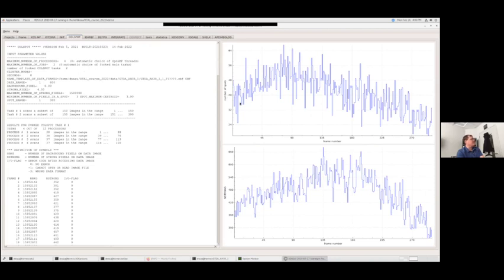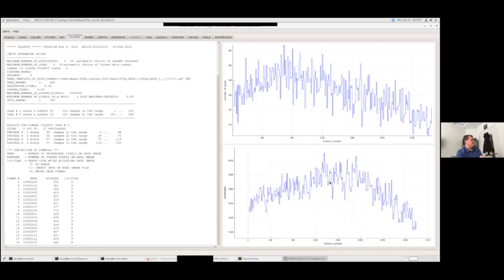40 per image. Maybe you can get away with 20 per image even. But it should be relatively high. It should be relatively consistent across the total data set. So one of the things we can see here is that the number of spots is starting to decrease. So this did not update properly because I restarted the XDS. So it should go all the way to 450.